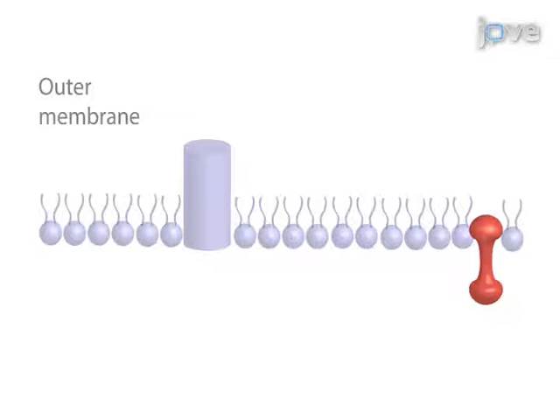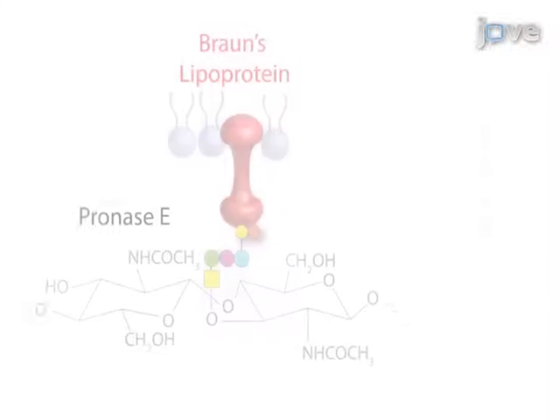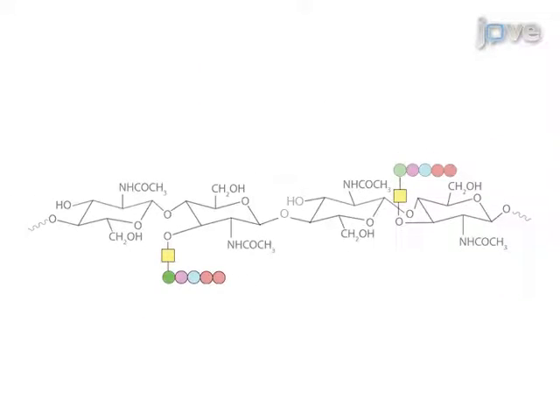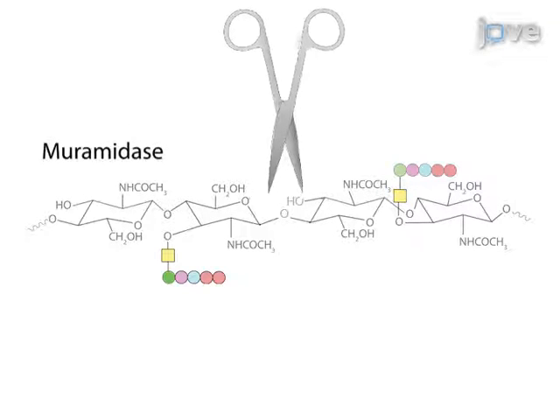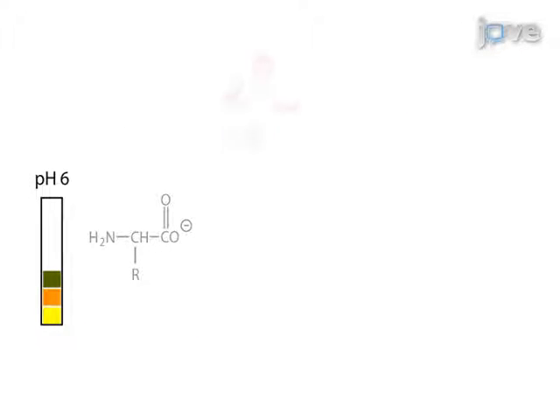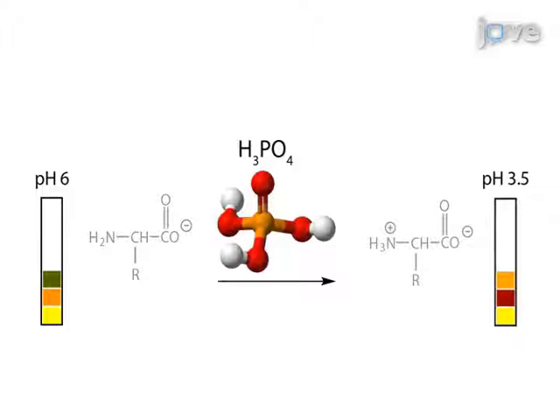After washing out SDS, the second step is to digest samples with pronase E to purify away the outer membrane of gram-negative bacteria. Next, the samples are digested with muramidase to solubilize the peptidoglycan into individual muropeptides. The final step is to reduce the muropeptides and adjust pH to the muropeptide isoelectric point.